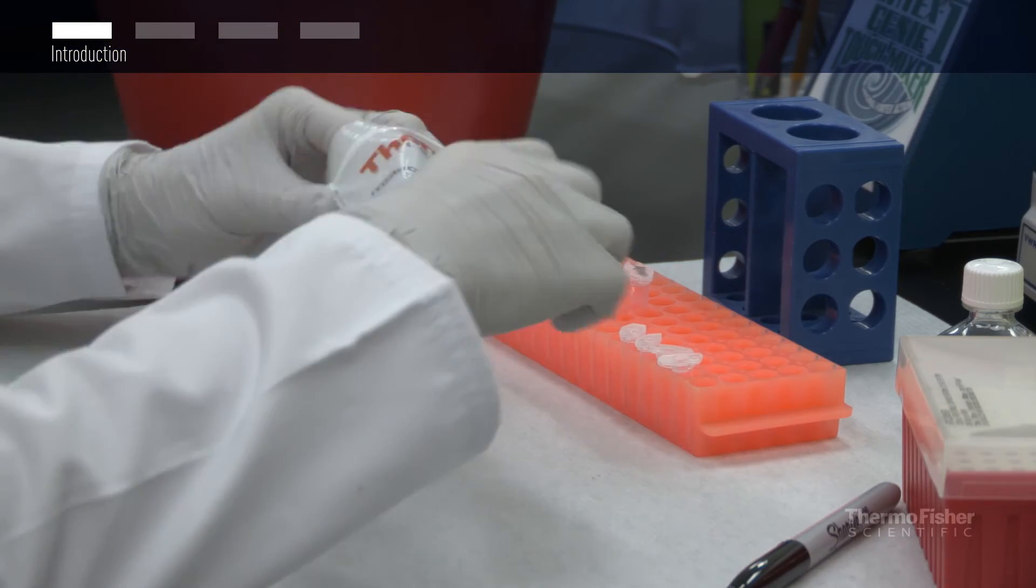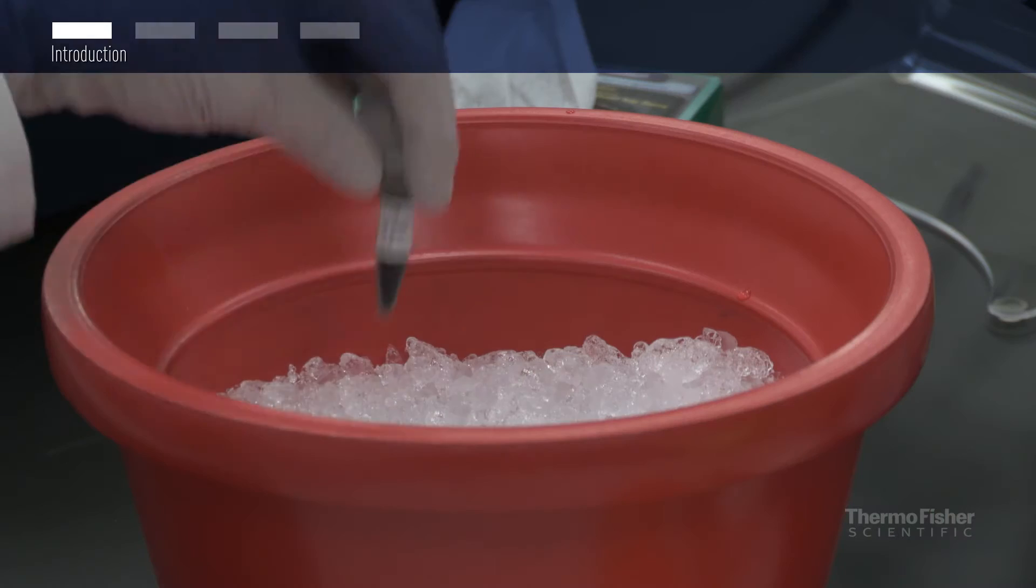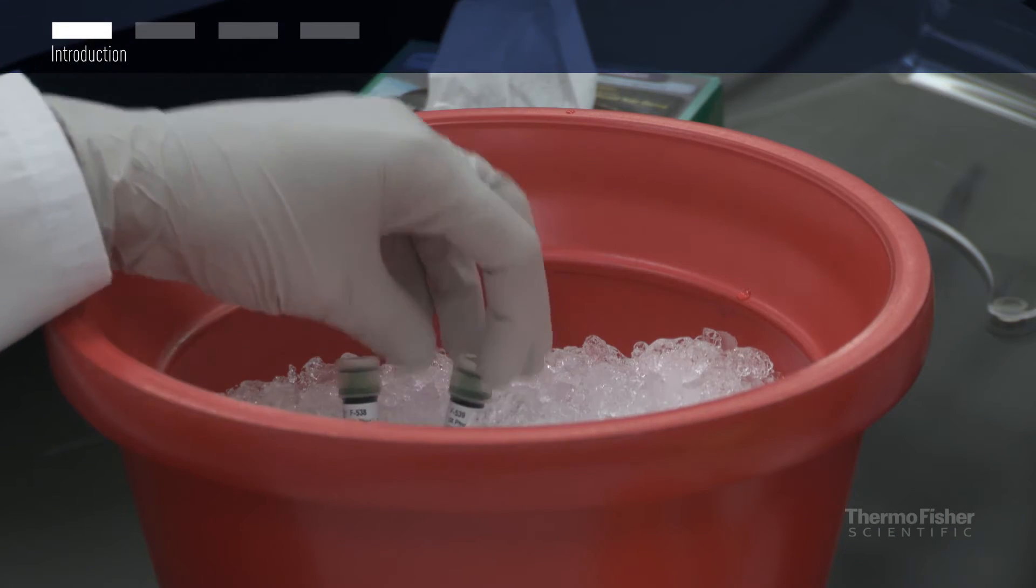For this example, we are going to set up a PCR reaction and amplify a 500 base pair fragment. Let's set up the cycling conditions first.